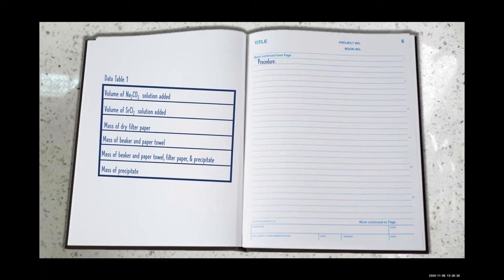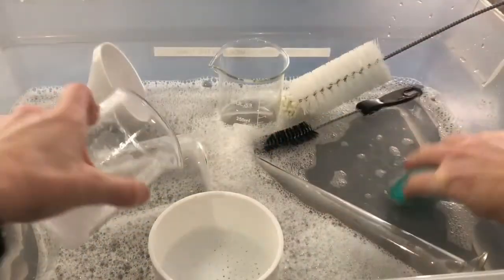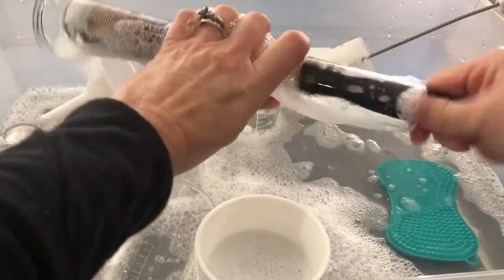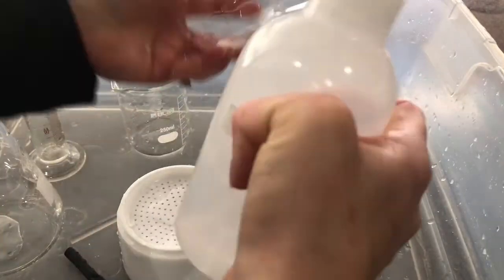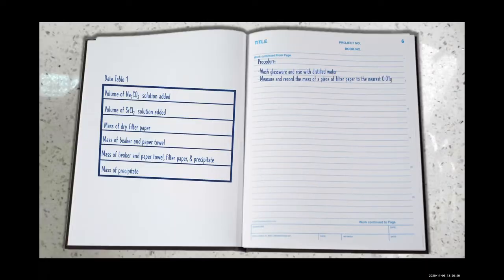For our procedure, we will begin by washing glassware and rinsing it with distilled water. Next, we will measure and record the mass of a piece of filter paper to the nearest 0.01 gram.